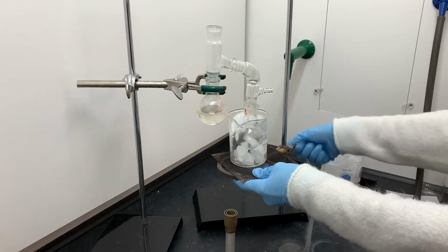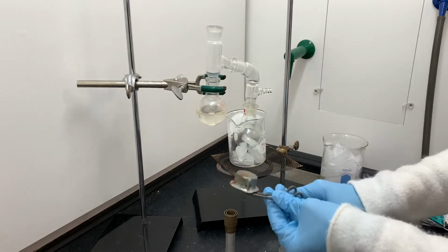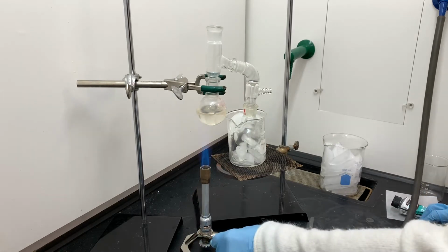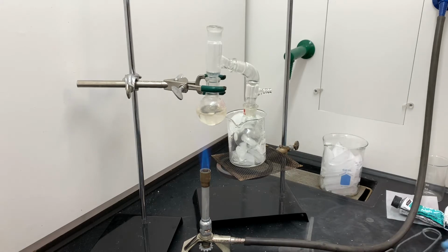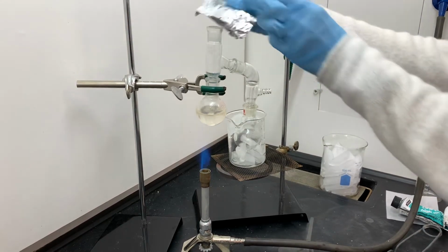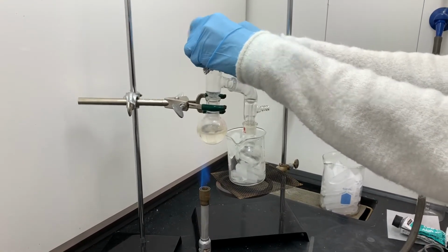So we want this to be heating gently, not heating violently, and that's tricky to do with a Bunsen burner. So I've got everything raised up so that everything will be a little bit further away from the blue tip of the flame. And then something that you can't see just because of the perspective in this video is that I don't have that blue flame positioned directly underneath the round bottom flask. It's actually sitting a bit to the front. It's maybe 2 inches ahead or in front of the round bottom flask, and that's to avoid direct heat between the Bunsen burner and the round bottom flask, again because I don't want it getting too hot.